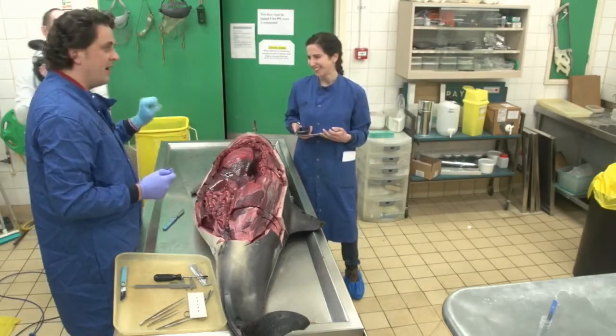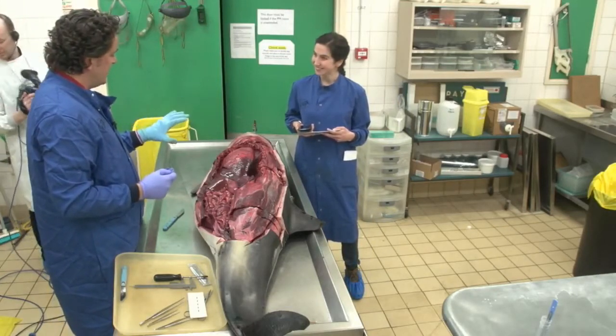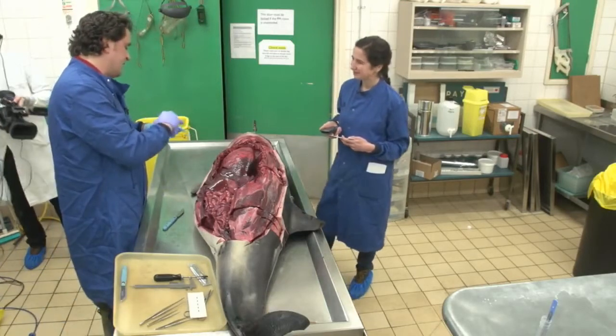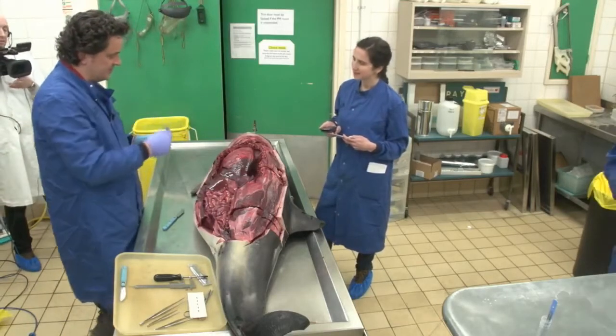So these are Kevlar gloves. Is that right, Matt? Kevlar, yeah. It's there to prevent you cutting yourself, as I found out to my cost a few weeks ago, so best to wear them. If you do cut yourself, it stops it going to skin, hopefully just cuts the glove. So your non-cutting hand, you have these on.